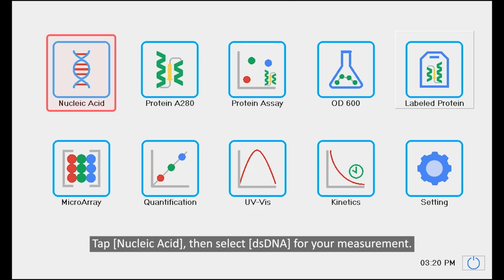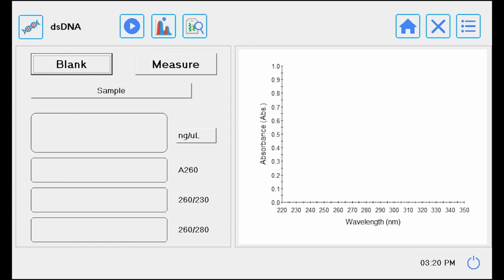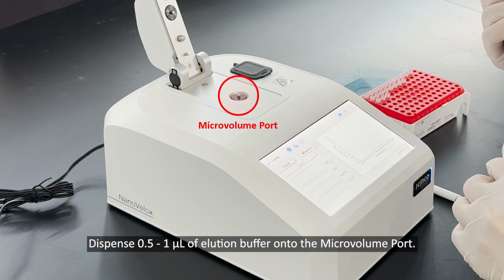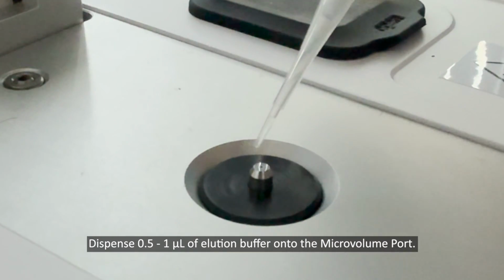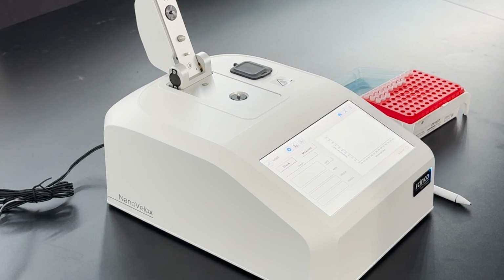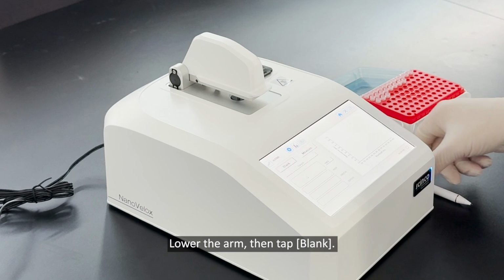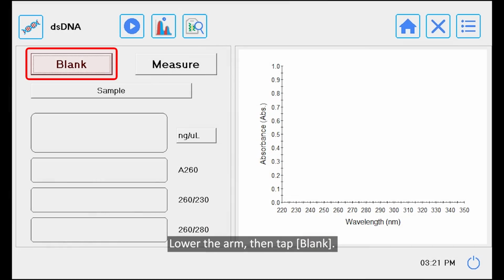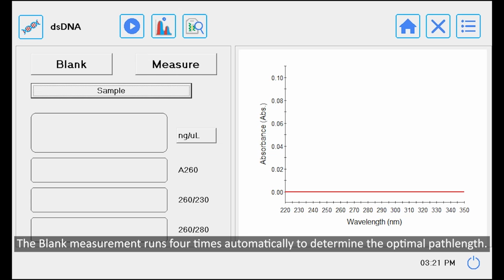Tap nucleic acid, then select dsDNA for your measurement. Dispense 0.5 to 1 microliter of elution buffer onto the microvolume port. Lower the arm, then tap blank. The blank measurement runs four times automatically to determine the optimal path length.